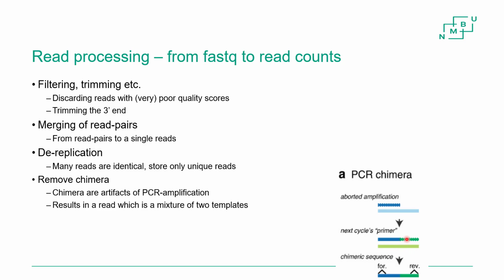So we use this and we extend it by copying this part of another organism, right? So you end up with a mixture, right? The read you end up with is partly from the blue and partly from the green organism. Hybrid, you could say. And this is what we call a chimera in this language, you could say.